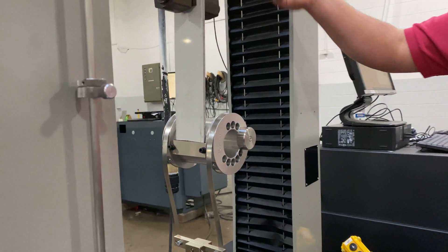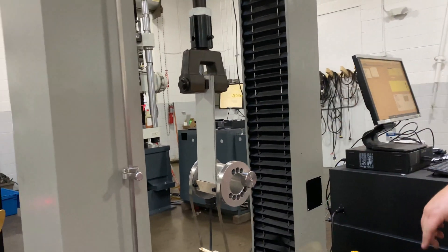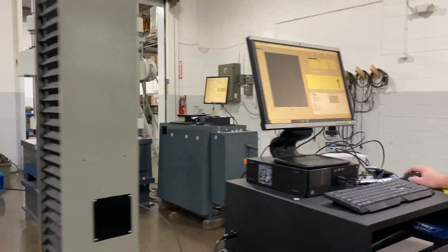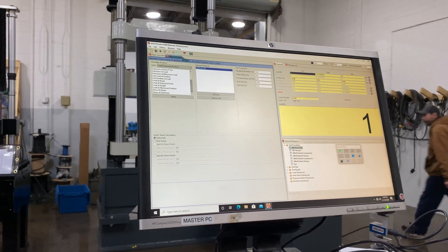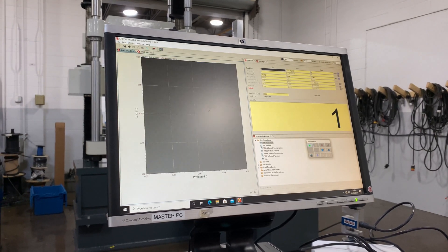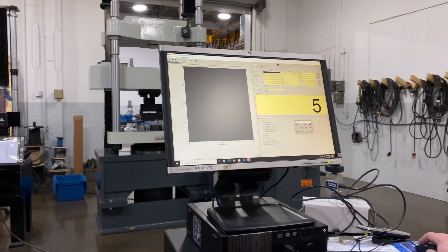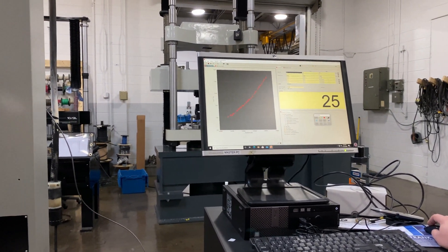As the crosshead moves up, this climbing drum will peel the laminate away from the main material. From the Quattro side, everything's set up with ASTM D1781. There are a couple basic parameters needed to do the analysis properly, and then we simply press play. The machine moves at five inches per minute preload and then one inch per minute through the test.